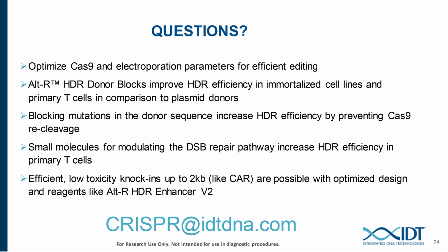Good question. The donor oligos are synthesized as ultramers, so those can go up to 200 nucleotides total. So that's including the homology arms and the length of your insert. So generally for everything larger than 200 bases, use a donor block. Anything less than 200 bases, use a donor oligo. And that will also depend on your insert size, whether you need to compensate with larger homology arms. So it's more based on the total length that would make the decision of donor oligo versus block.